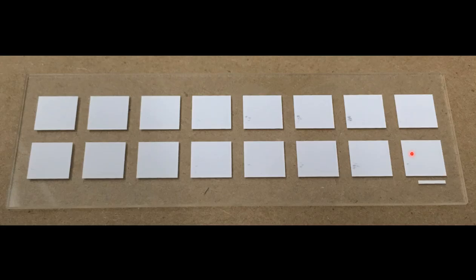Here you see the protein array, and in each square there are 225 protein spots. So in total, these are here 3,600 protein spots on this protein microarray.